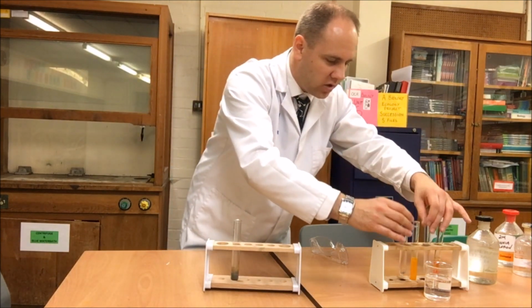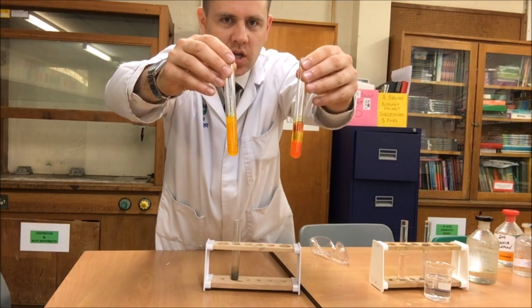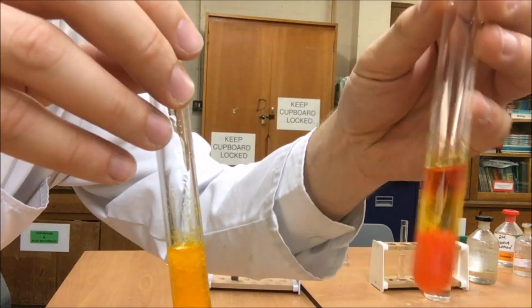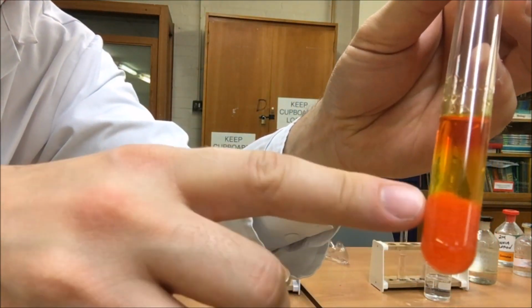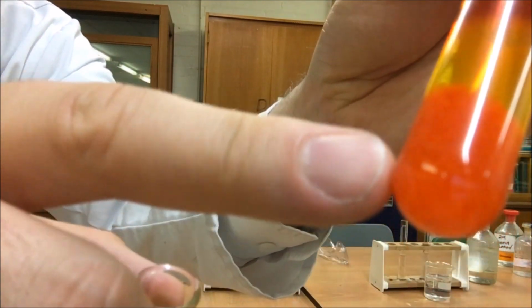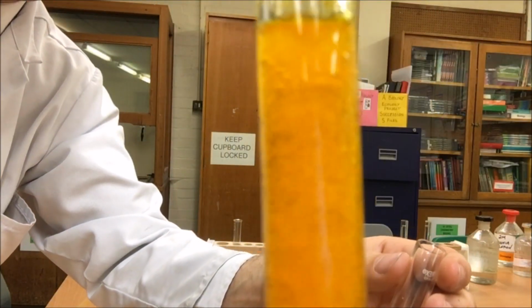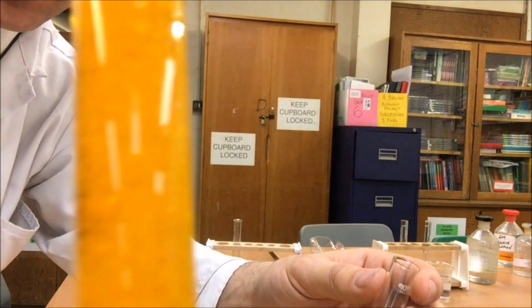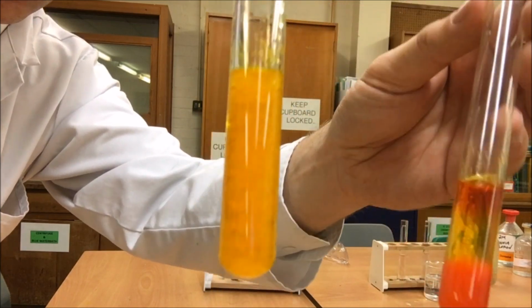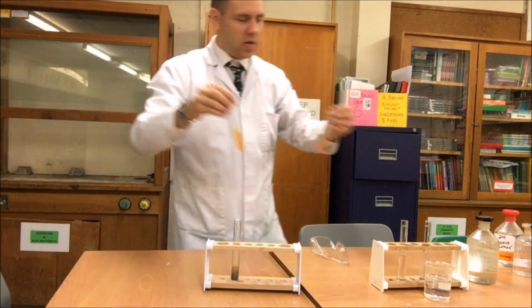If we have a look at the 2,4-dinitrophenyl hydrazine test, you can see that these are nice precipitates, and I shall bring these closer to the camera. So, on this side, we have the 2,4-dinitrophenyl hydrazine positive test with the glucose, which has turned a lovely orange. And this one here is from the acetone, which has turned a lovely yellow. You can see the solid in both of them, and what we would do then is we would filter them off and then do a melting point check to determine the purity of what we have made.